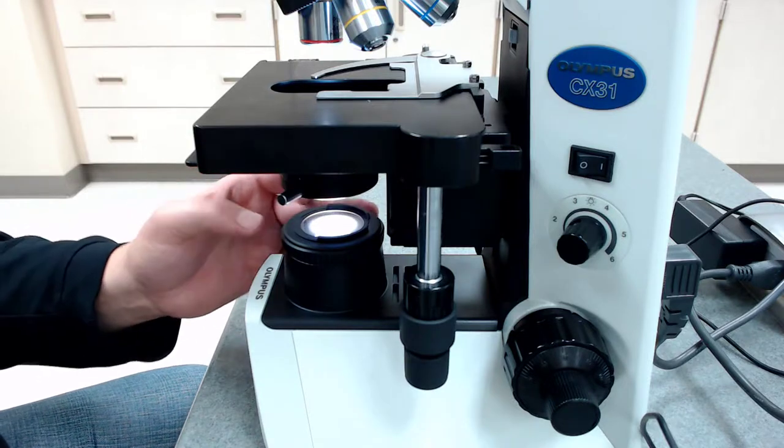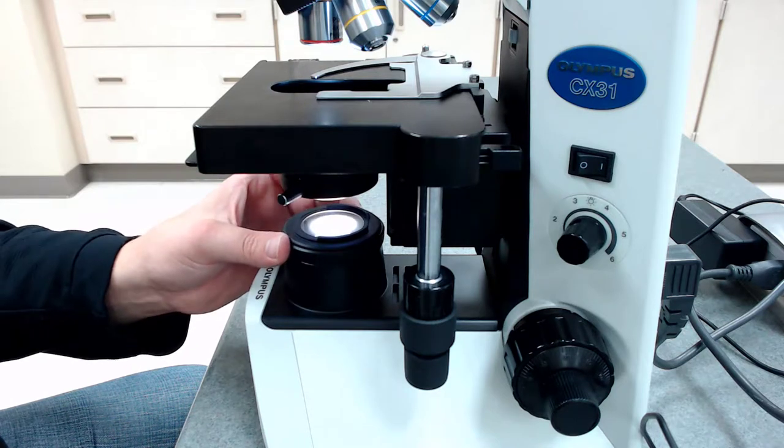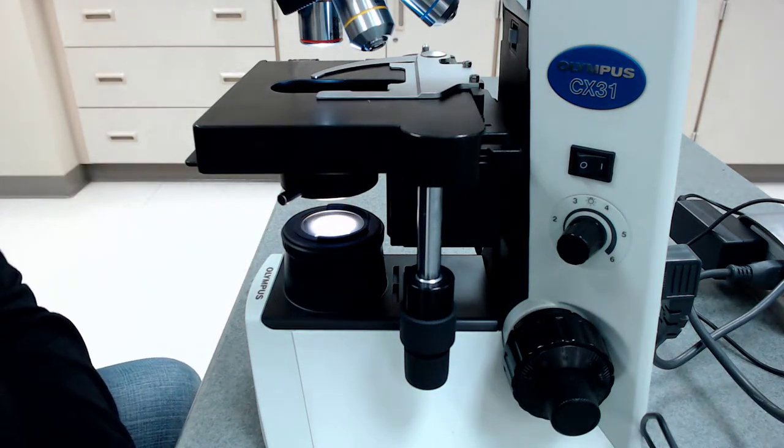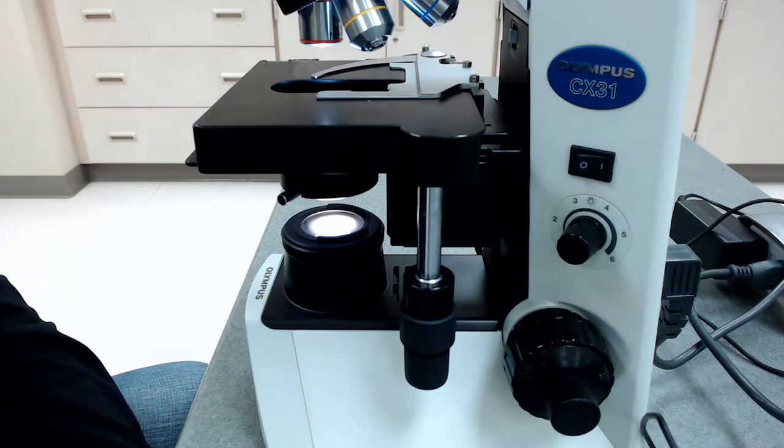This microscope also has this ribbed portion here on the bottom where I can control the light right at the bulb, but I rarely ever have to use that. So that's kind of the art of using a microscope is knowing how to fiddle with light intensity to see what you need to see.